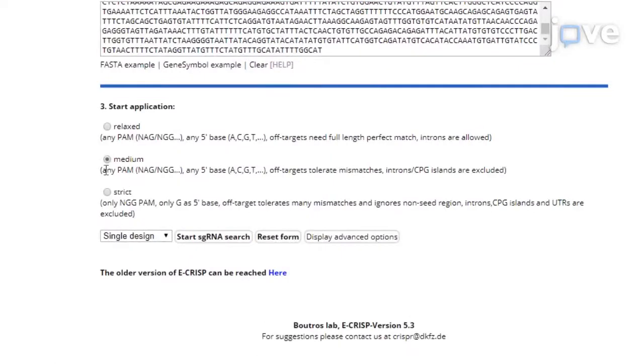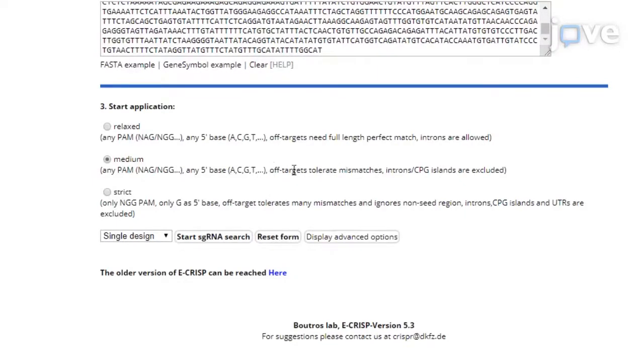Start a guide RNA search using medium application settings with any PAM, any 5' base, off-targets tolerate mismatches, and excluded introns and CPG islands.